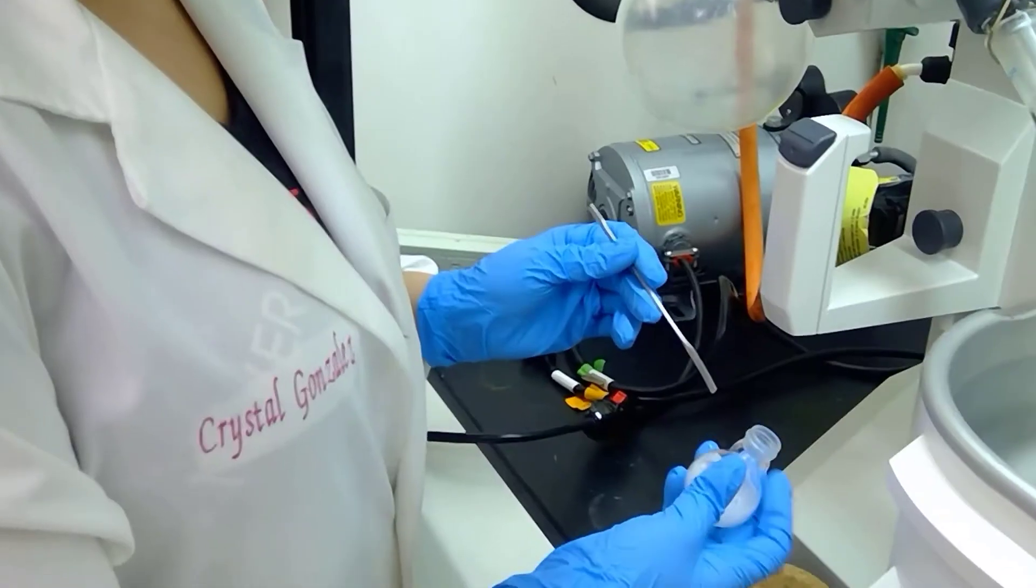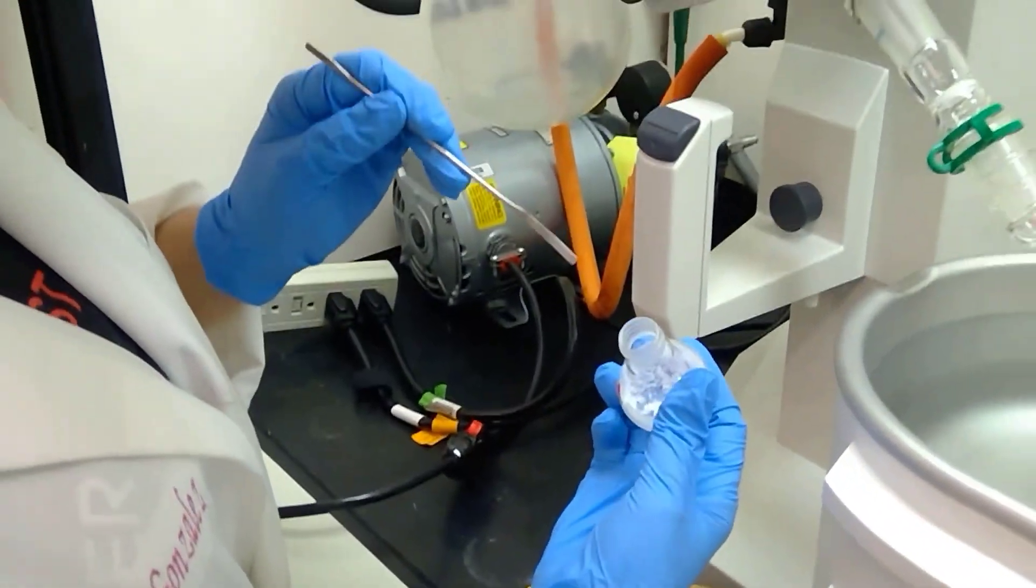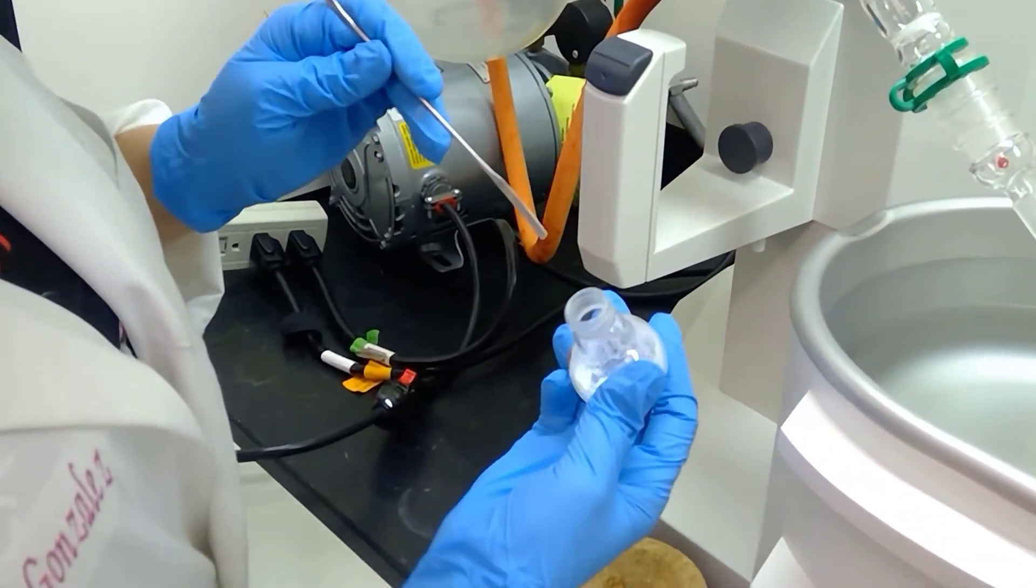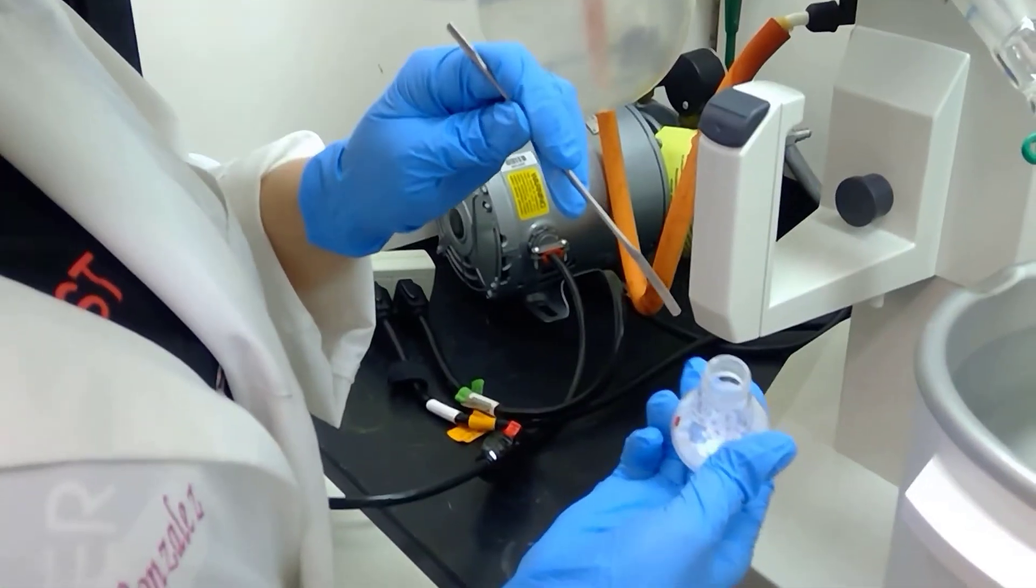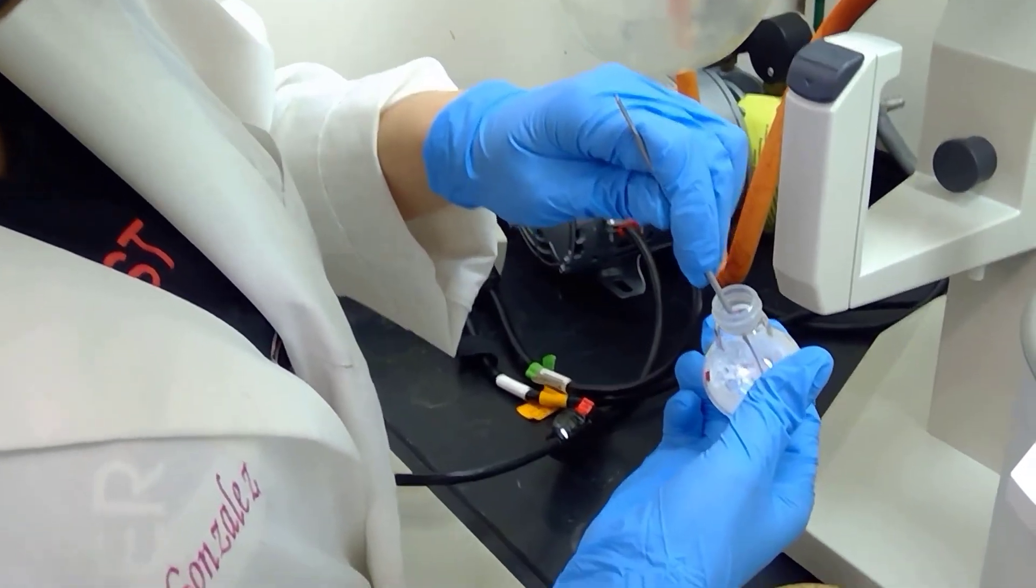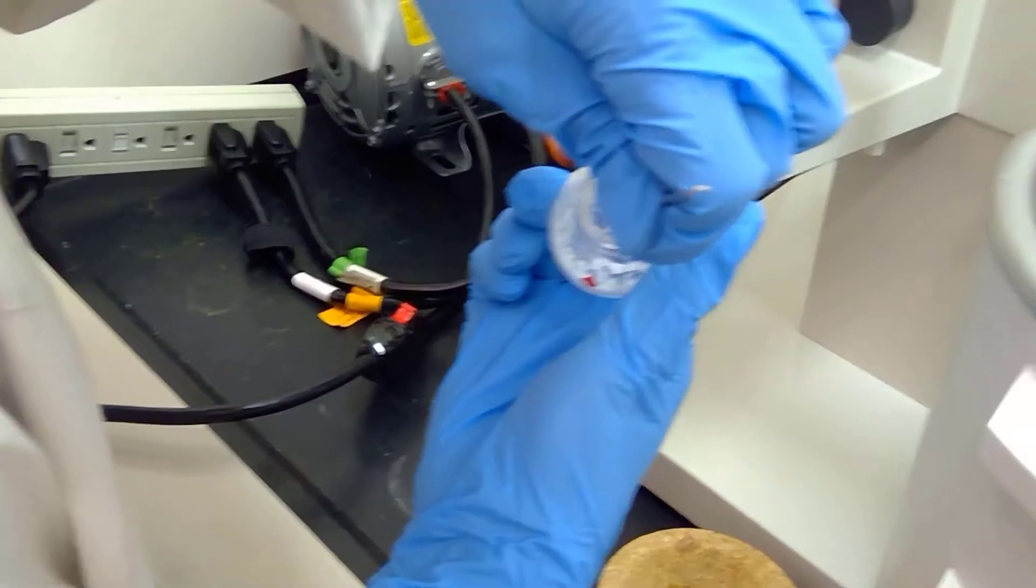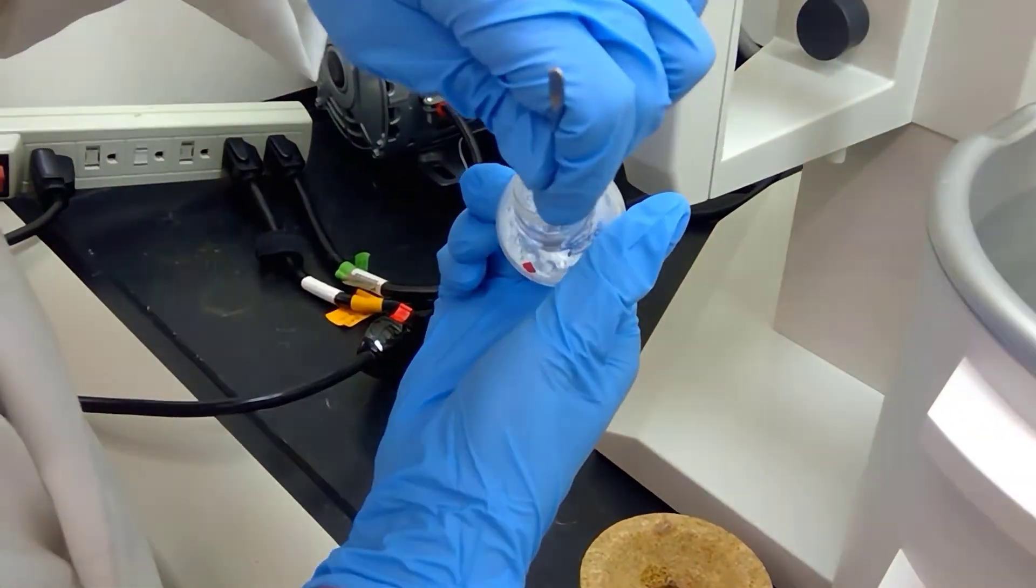I have removed the sample from the rotavap. Because tert-butyl methyl ether is a solvent that often sticks to the compounds you're trying to dissolve in it, I'm testing to see if our solid is actually solid. This is wonderful - I'm actually able to flake the compound and move it around with my micro spatula.